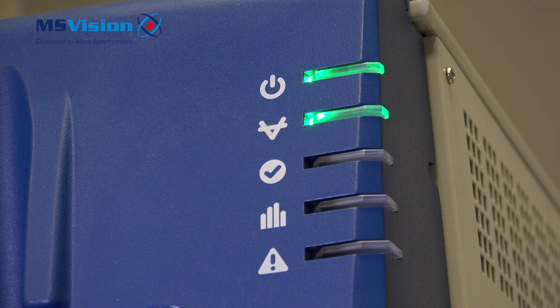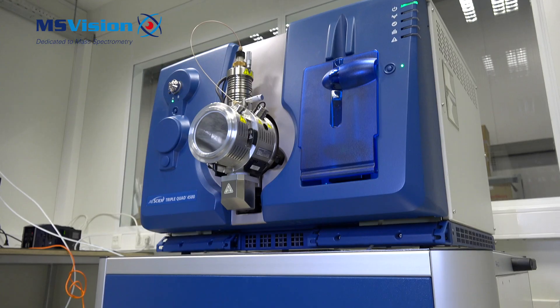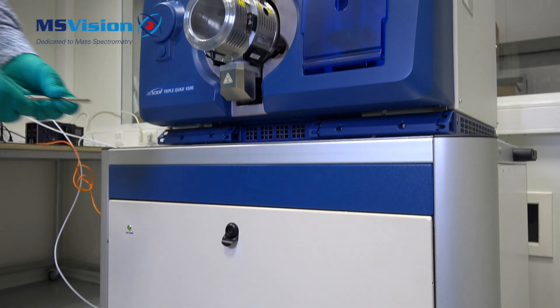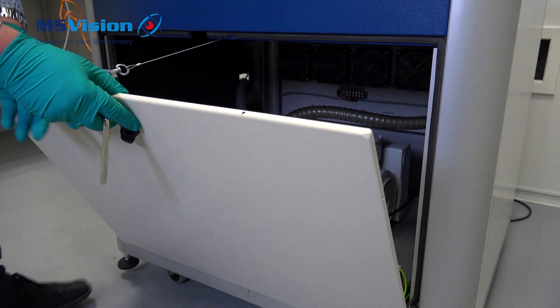Once the system is vented, the green tick LED will flash slowly. Depending on the system and pump setup, you may have to manually shut down the rough pumps. To do this, use an Allen key to open the front cover of the MS table.